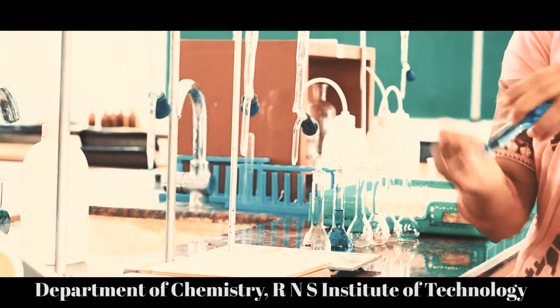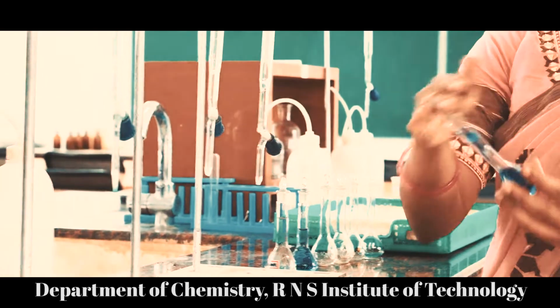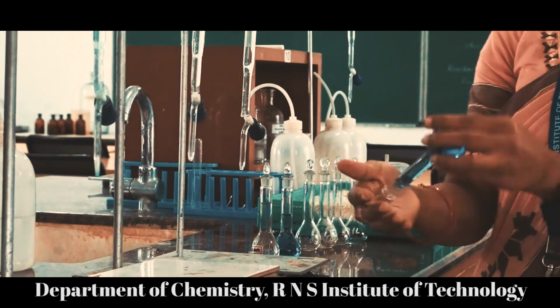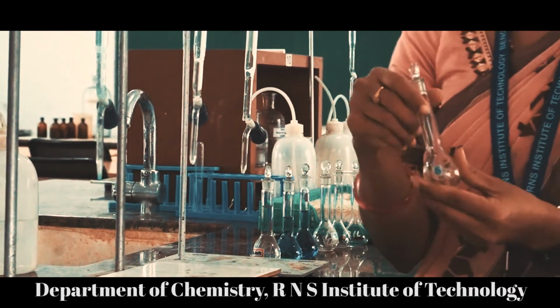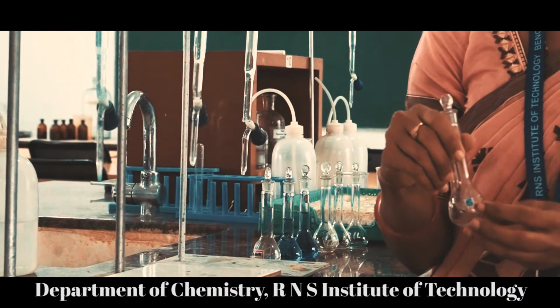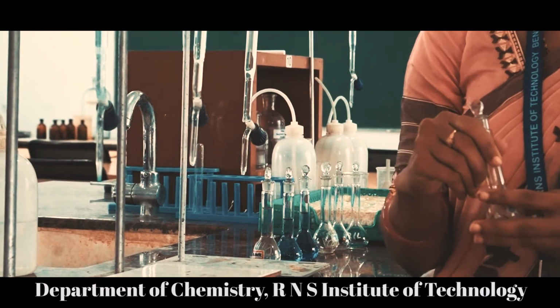Close the knob, shake for uniform concentration. Likewise, flask number 6, 8 and 10. We are adding 6 ml of copper sulfate, 8 ml of copper sulfate, 10 ml of copper sulfate respectively.